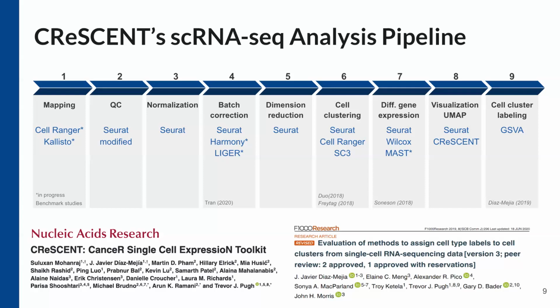If it's not, then you're going to have to look into something called Cell Ranger if you're using 10x, or whatever recommended mapping tool. And the way mapping works is all these RNA reads are transcribed, and we look at the DNA, but we map it back as chunks into the human transcriptome.